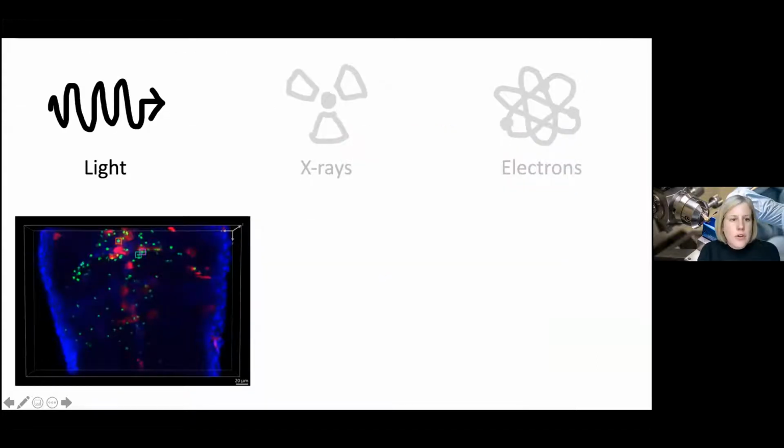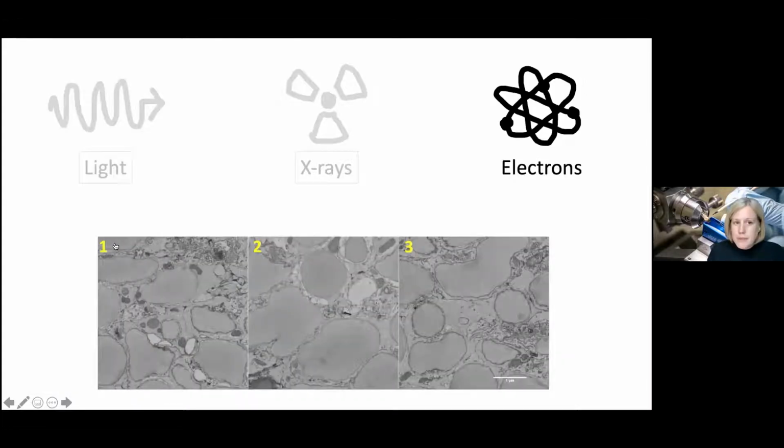So just as a general principle for correlative experiments, we normally start with fluorescence microscopy and would use whichever type of fluorescence the research group has optimized for their sample, whether that is wide field, confocal, maybe light sheet or super resolution light microscopy. So in the zebrafish work here, the hindbrain has been cut into 100 micron thick sections using a vibratome and then imaged in, this is either confocal or Airyscan. So now you've already cut down your volume from the entire model organism, and you have some very nice resolution on the individual parasites and the macrophages. So MC would then take that information and use it to target. I'm missing out some detailed steps in the protocol. I'll come back to that later.